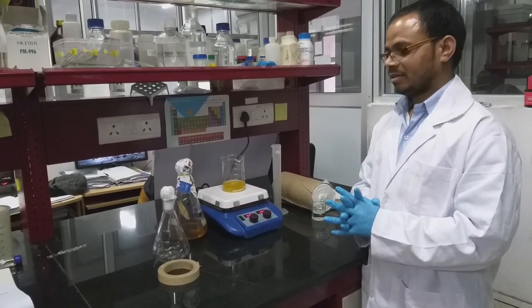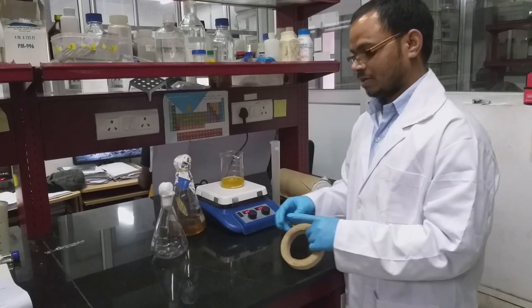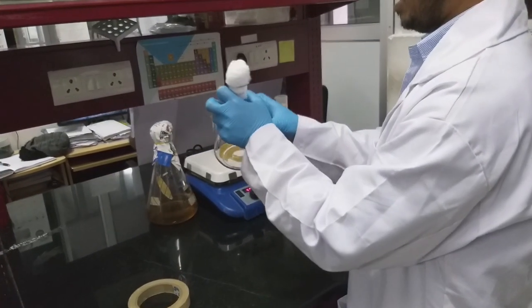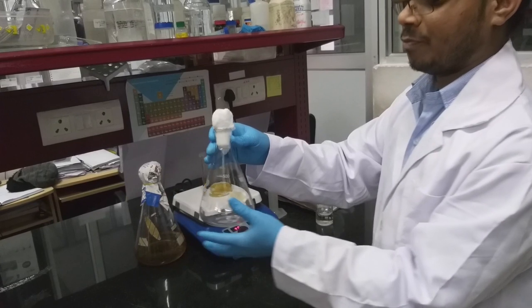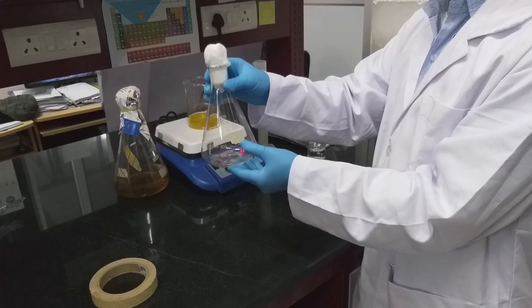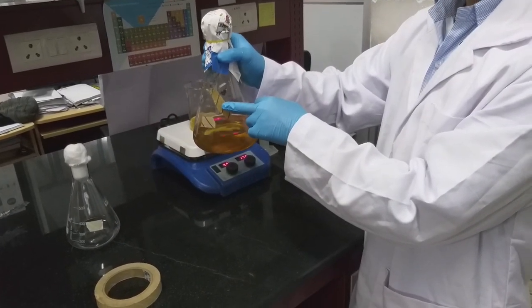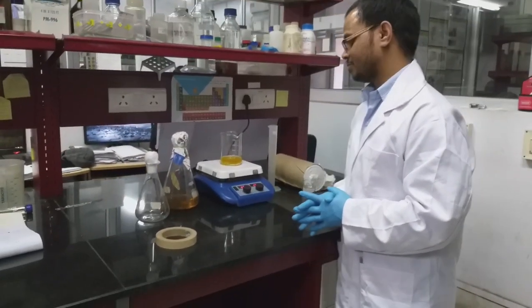In order to check whether the media is autoclaved or not, we use a sterility indicator. This is a paper based sterility indicator. We have to paste it onto the flask and we have to autoclave. If the autoclave is properly finished, then we will see the white strips turning into black ones. So this is the indication that the autoclave process is complete.